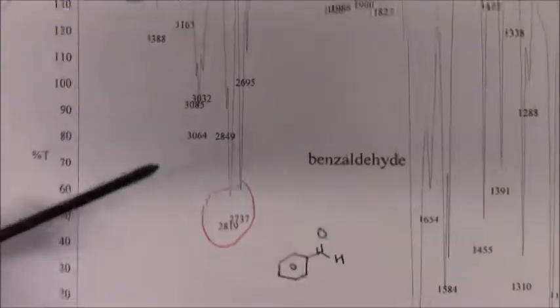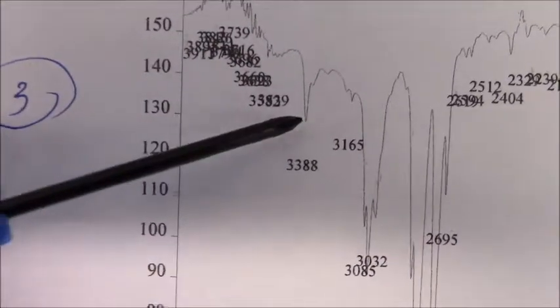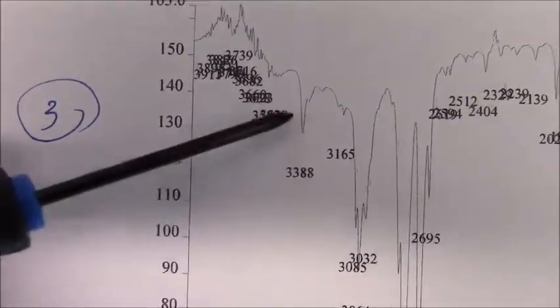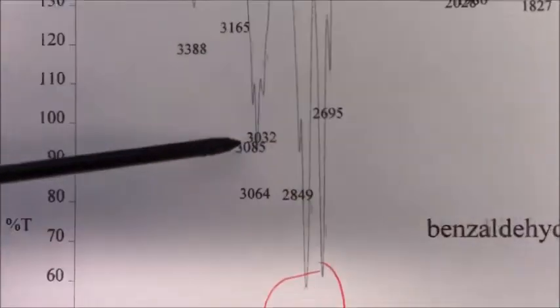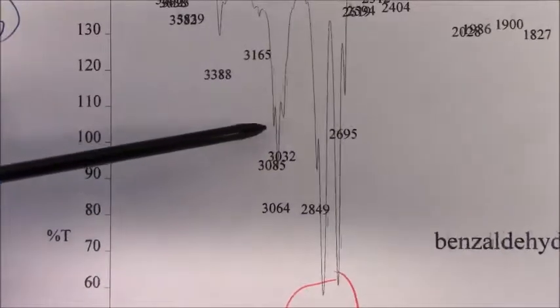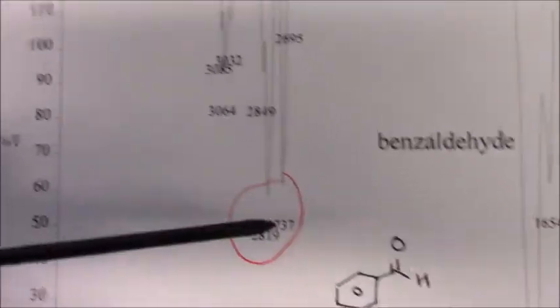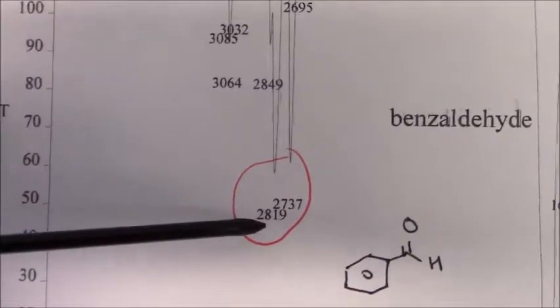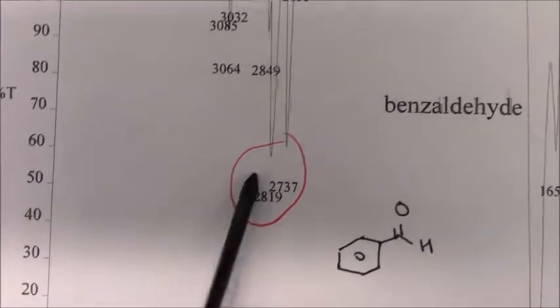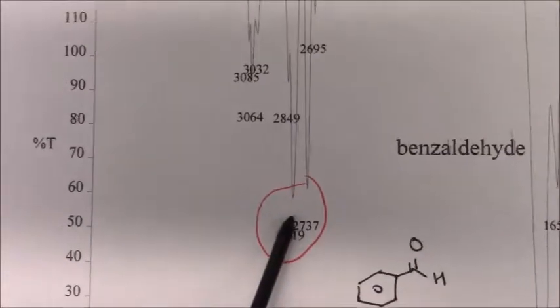And then we move on to IR. So benzaldehyde, we've done this before, but I will do this again. Whenever you see a little spike here for a carbonyl compound, when it's clear as day, a little tiny sharp spike, that's the overtone of the carbonyl C double bond O stretch. These just over 3,000 ones are sp2 hybridized carbons with an H on them, stretching. This is the classic 27 and 28 Fermi doublet for this hydrogen stretching on that carbon. It's an aldehyde CH stretch, the classic Fermi doublet, right?